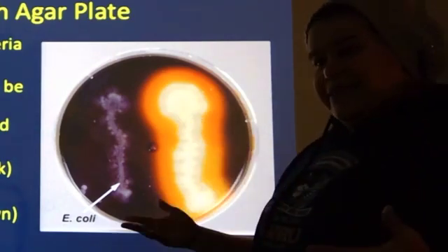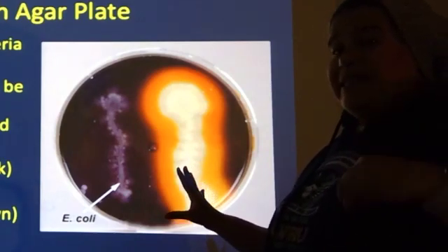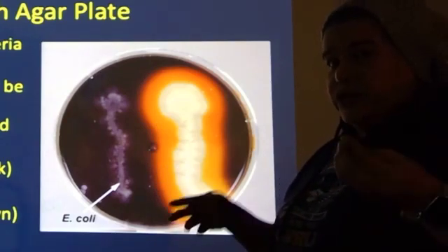Again, why are we doing this? We get more information about the bacteria and the characteristics it has. It makes it easier to identify. It makes it easier to narrow the field like a detective of here's a clue, here's a clue, here's a clue.